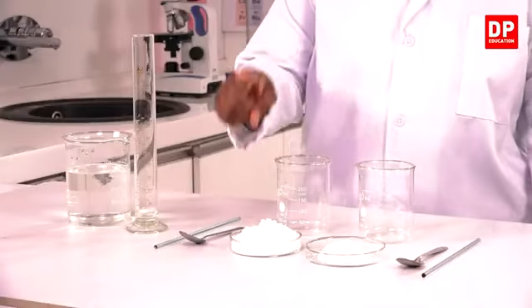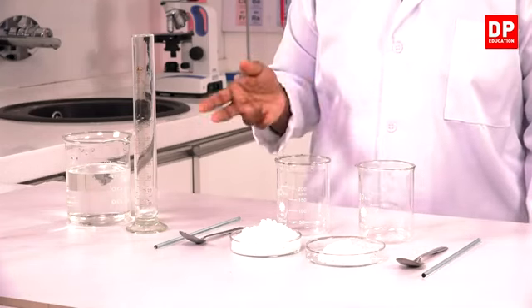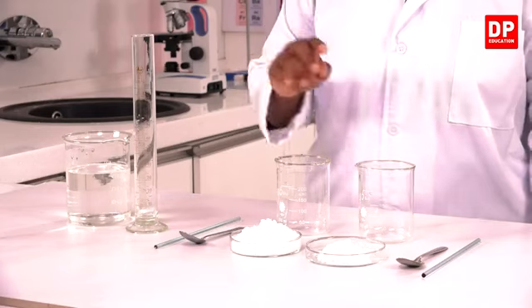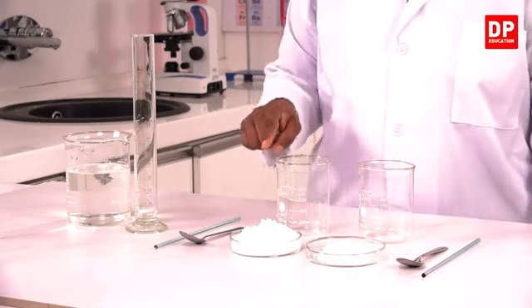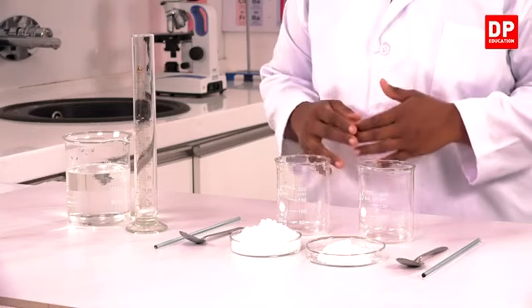To that, we add two different solutes. One is sodium chloride, common salt, and the other one is calcium hydroxide. So here you can see both are solid components, and this is 100 grams of sodium chloride. Here I have 10 grams of calcium hydroxide.